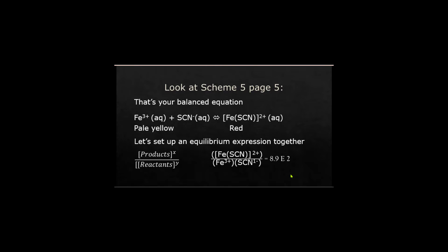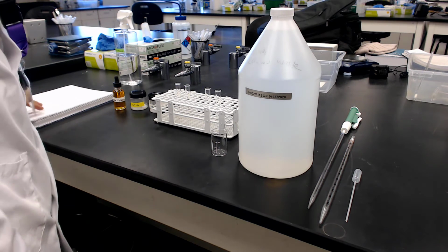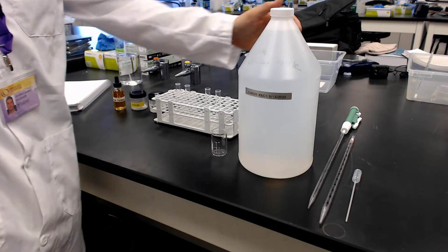So now get your notebook ready, get your lab book ready, and you are ready to start watching the actual experiment and recording observations. And again, I recommend taking some screen captures when you see a significant test tube color come up, and make a note to yourself what it is, after what stress did you get this color, and this is going to be nice for your observations later. All right, now we're going into the lab with Jonathan, and we're going to run the reactions. Again, we're working on part A, page 6, so follow along, and he'll guide you through the lab.